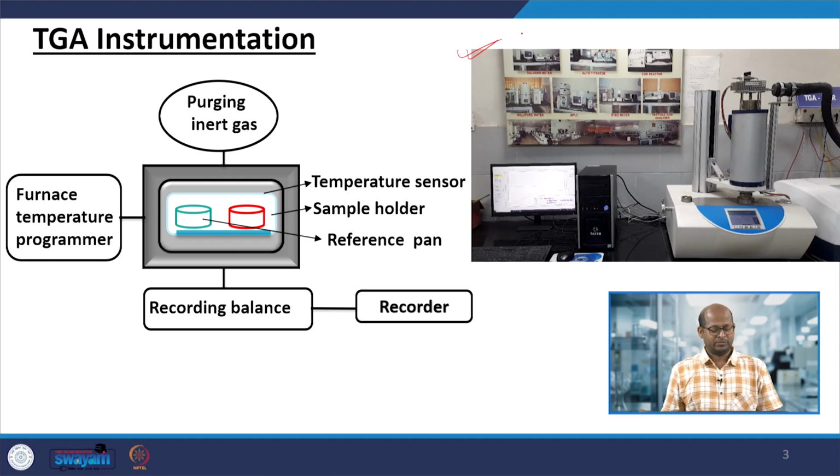So, the quantification is very important, in terms of weight. Suppose we are using 1 gram of catalyst, after half an hour or 30 minutes, how much quantity of CNT is deposited over the surface of that material, you can easily find out using these TGA instruments, or any experiments where coke is deposited, how much coke, and whether the phase of the material changes or not. So, here this is the experimental setup. You can see the TGA experiment.